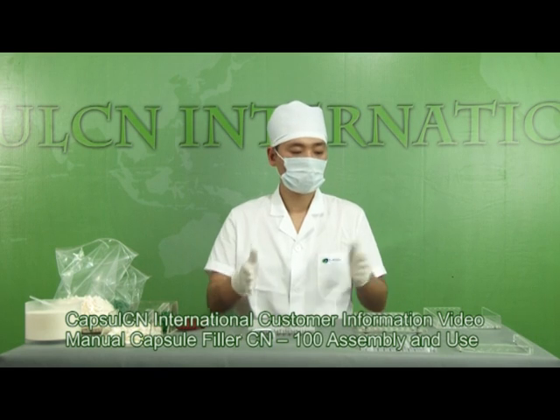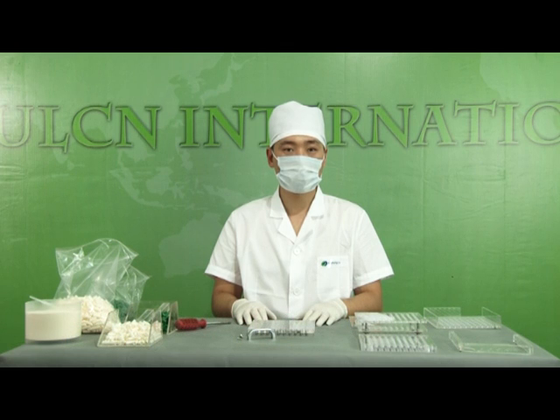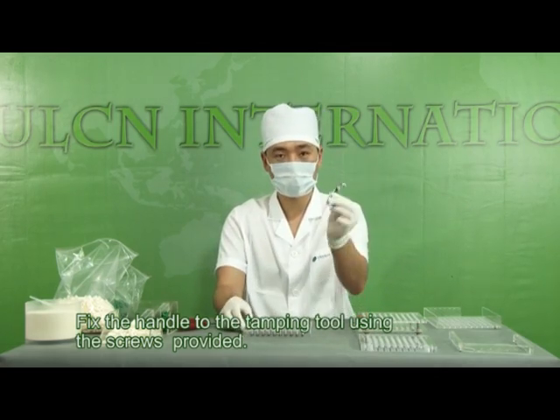Capsule CN International, Customer Information Video. Manual Capsule Fillers CN100, Assembly and Use. Fix the handle to the tamping tool using the screws provided.